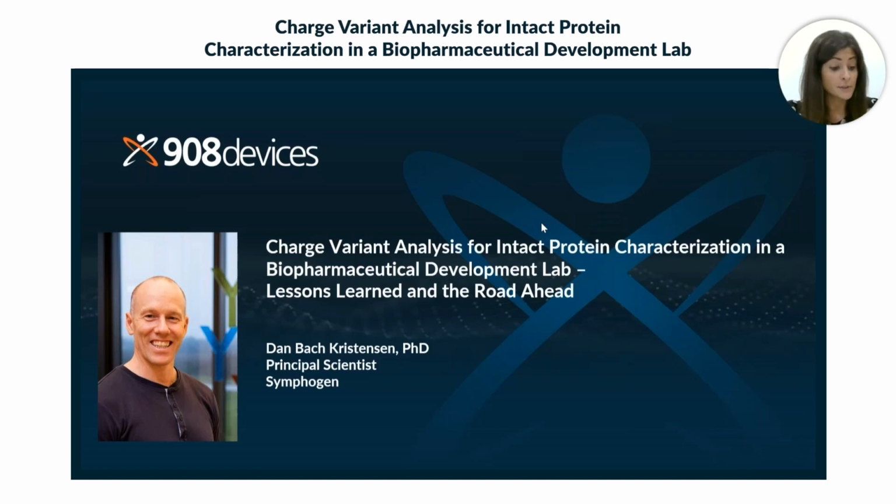Today we'll focus on the work that they're doing in their lab on charge variant analysis for intact protein characterization.